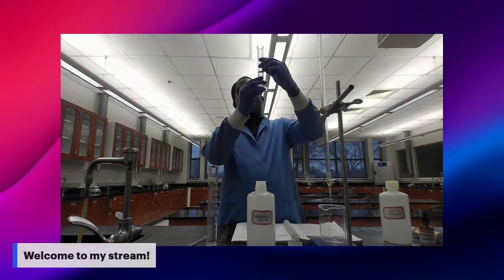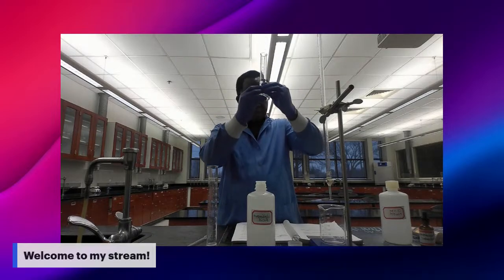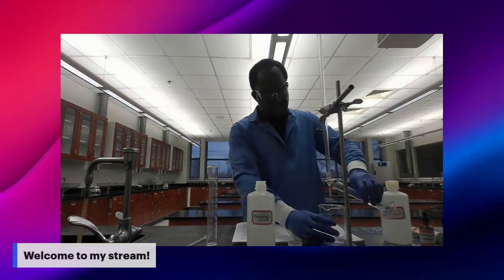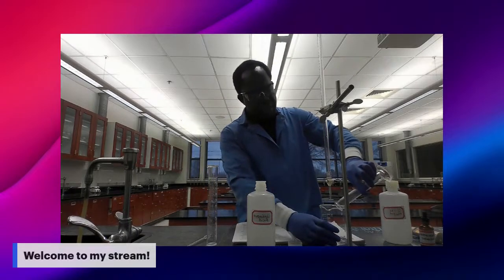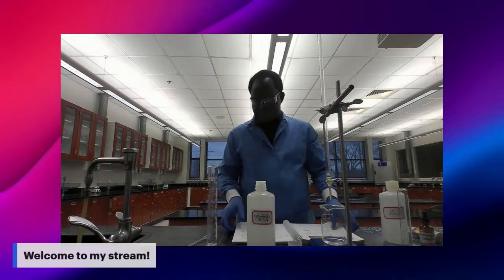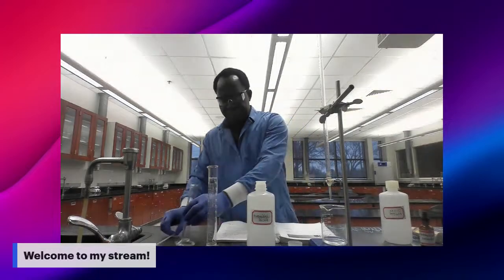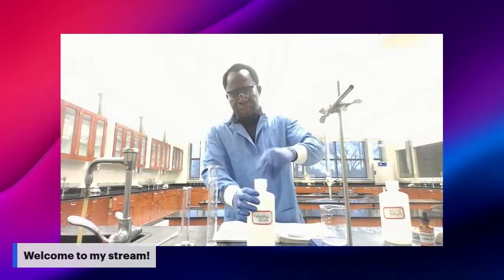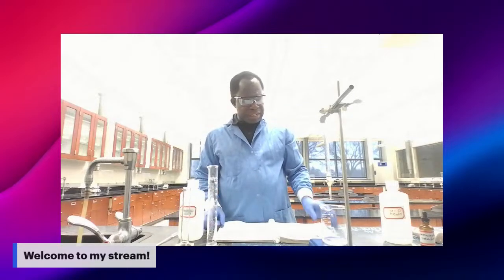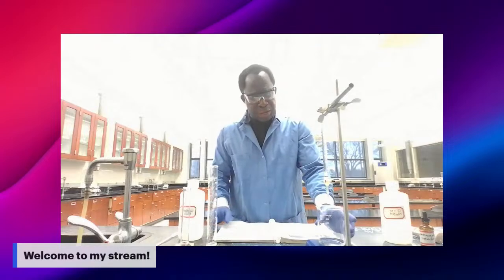So I got my 25 milliliters of acid. I'm going to pour it into the 400 milliliter beaker I have already set up for this experiment. So I have my acid ready for the experiment.